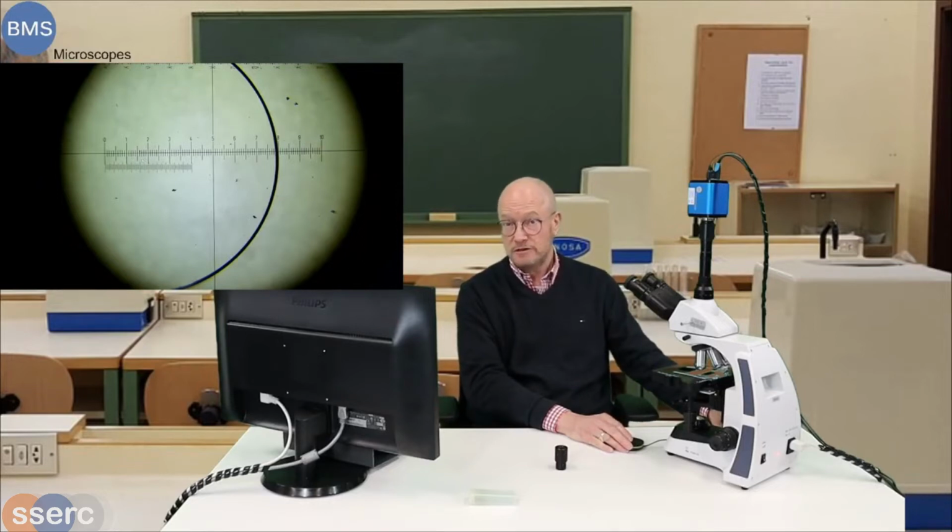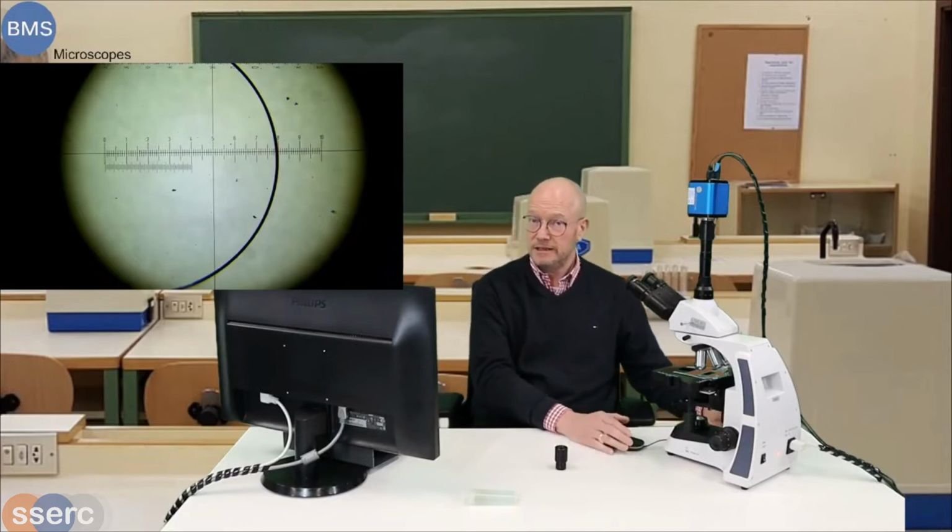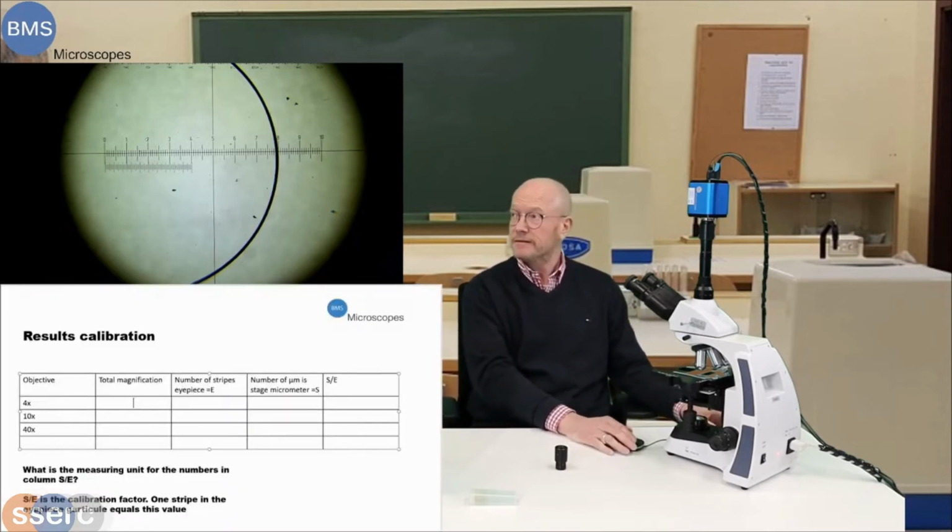The total was 1000 micrometers, I have to say. 500 micrometers equalizes 20 units of the eyepiece graticule. We can put that in a table to make sure that we have all the figures right.